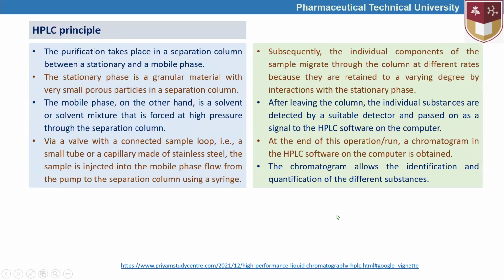Next. Okay, HPLC principle. We are going to read and understand the text. The purification takes place in a separation column between a stationary and mobile phase.